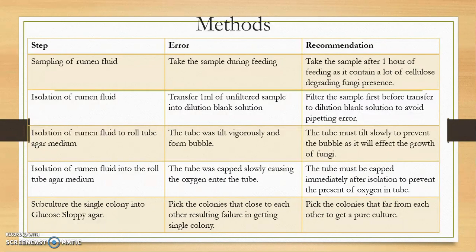Next, during isolation of the rumen fluid, there was some error during pipetting. So what madam recommended to us is that before transferring it to the dilution blank, we filter the sample first.